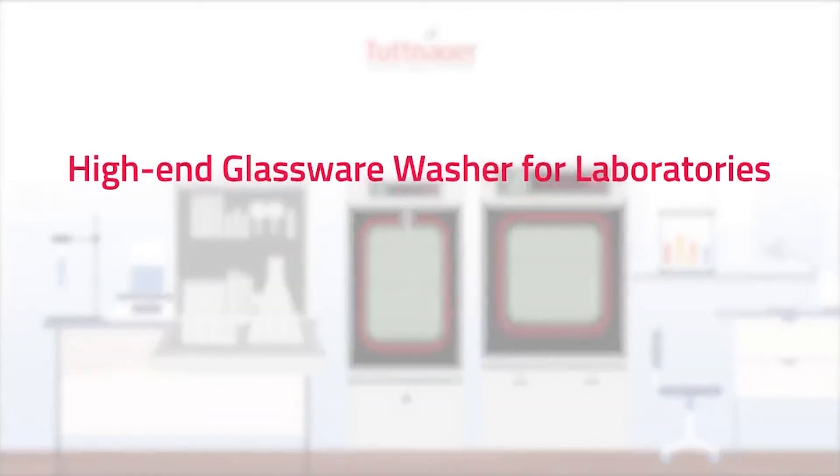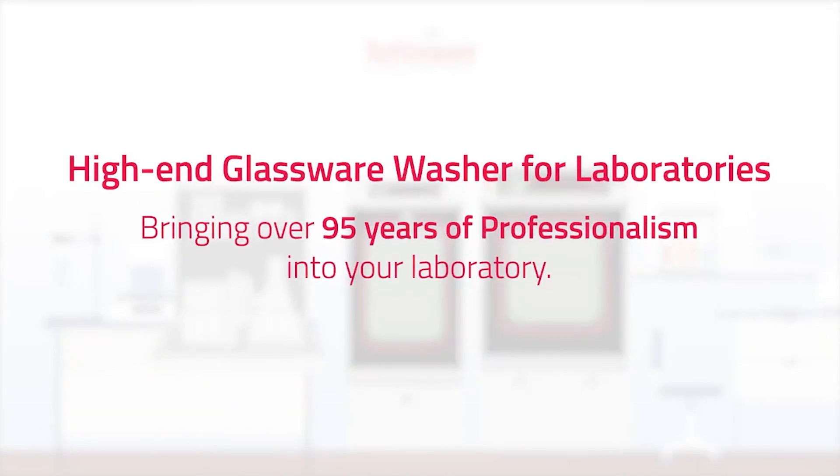High end glassware washer for laboratories, bringing over 95 years of professionalism into your laboratory.